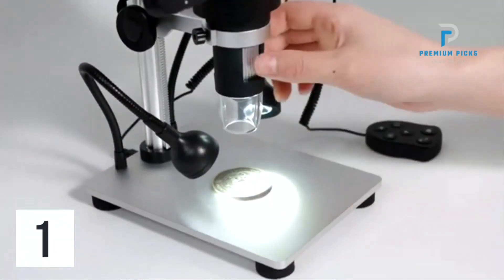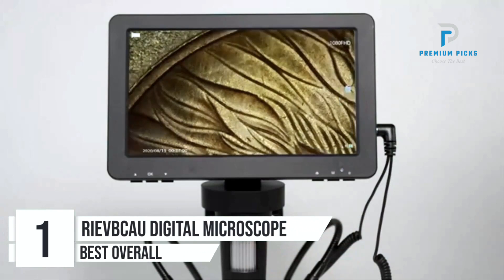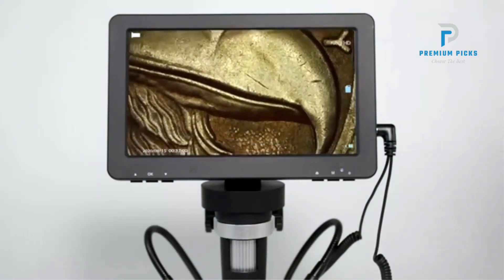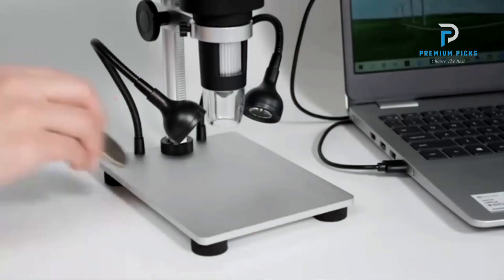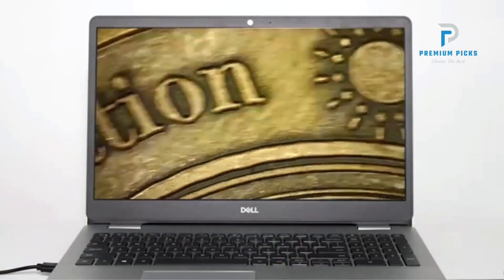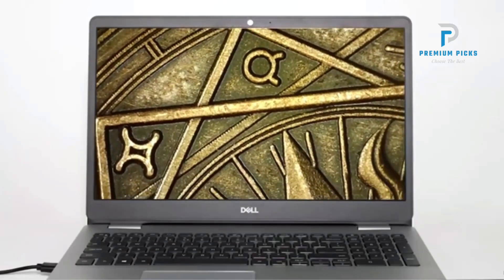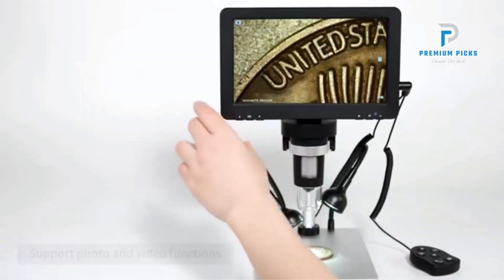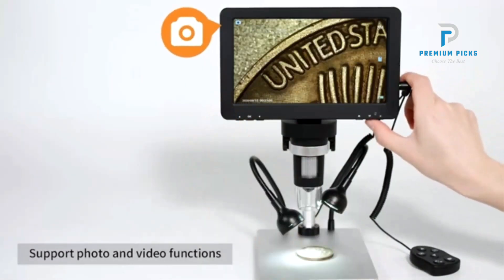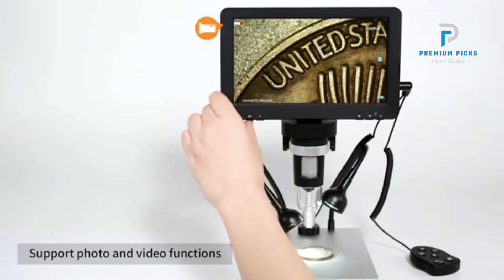Number 1: RIEVBCAU Digital Microscope. Equipped with a 48MP Panasonic sensor and 1080FHD video capability, this microscope delivers exceptional clarity and detail, ensuring precise observations every time. It features a 7-inch large HD LCD screen with angle adjustability for enhanced comfort and viewing flexibility.